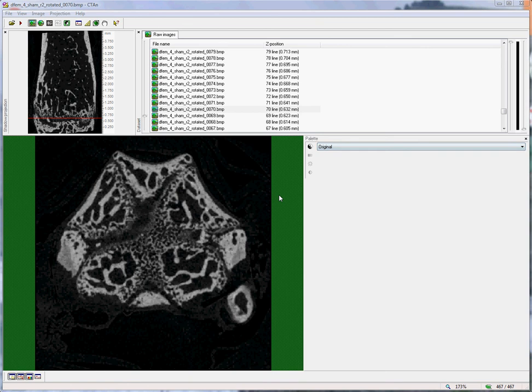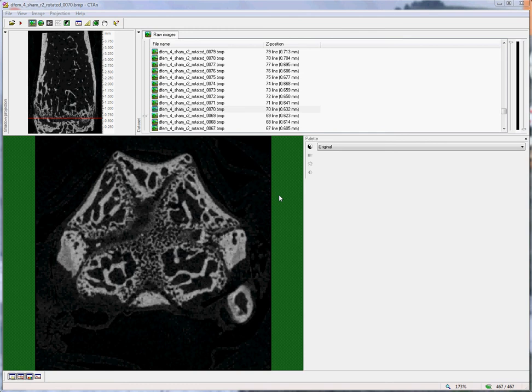Hello. This video shows how to select and delineate a cortical bone volume of interest from the mouse femur. The same method could also be applied to the mouse tibia or the rat femur or tibia.